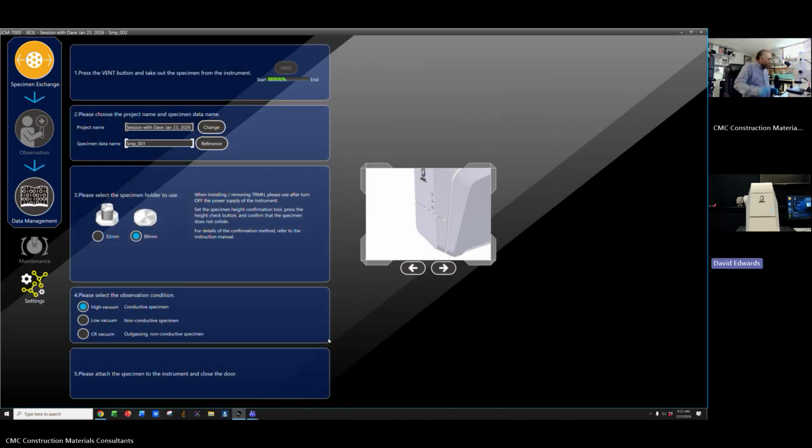So when George is working with you, or whoever it is that's working with you, you're going to want to use that sample that you're about to pull out, not your glass one, because the glass one will confuse them. They'll be thinking that they're looking at a reflection or something like that, which is kind of what I thought. So we're looking for something like Stokes. But it took it or it didn't take it. Sure.